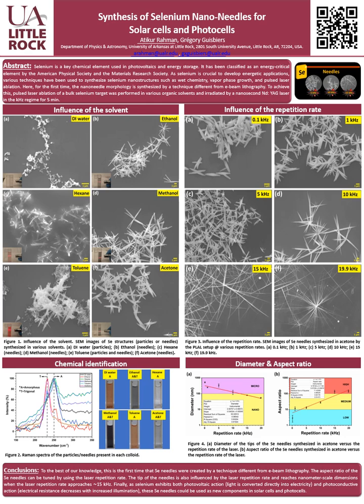This is the confirmation that we have nanoparticles inside the solvent. We can also check the color of the solvent. Some are pink, some are gray. Usually pink means you will get amorphous nanoneedles, and gray means trigonal.